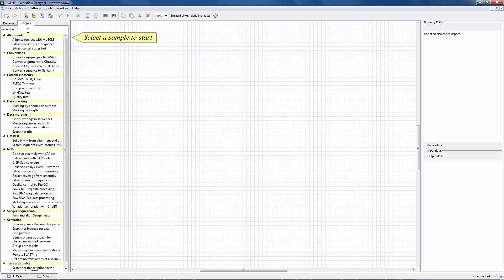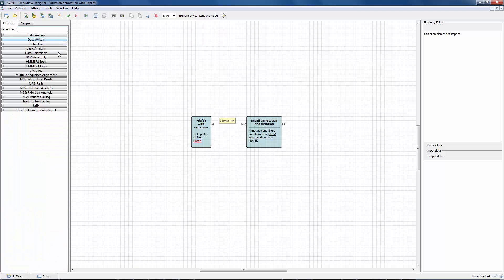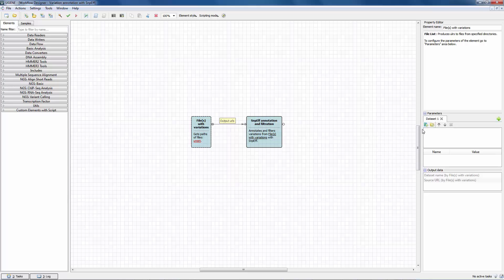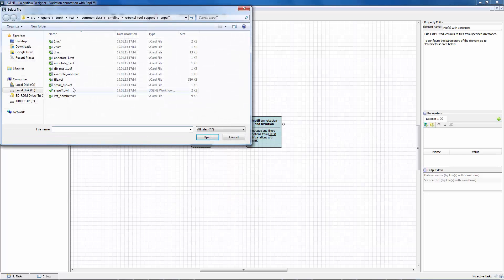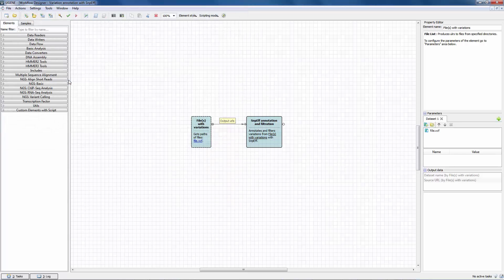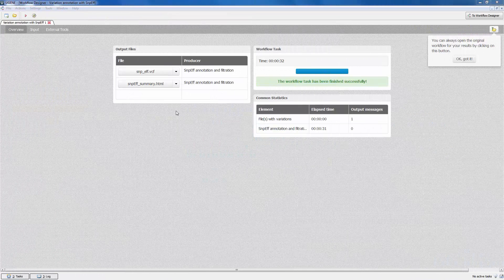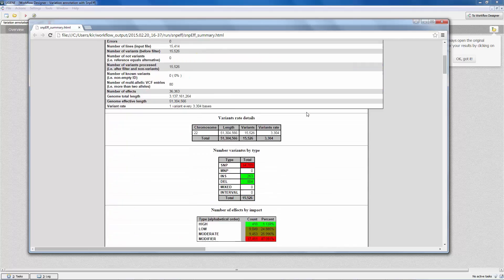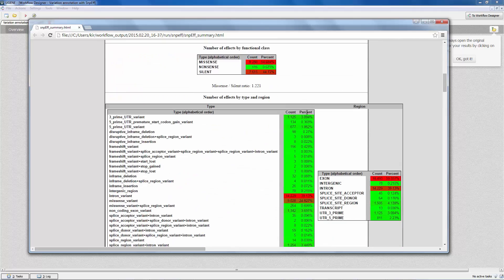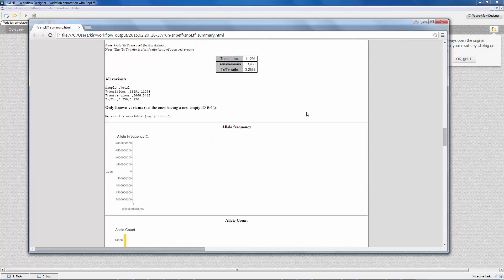A tool for analysis of genome variations, SNPF, was embedded into Eugene. It filters input variations and creates a report with the summary statistics about the set of variations. You can use this tool, for example, after running the variant called workflow in Eugene.